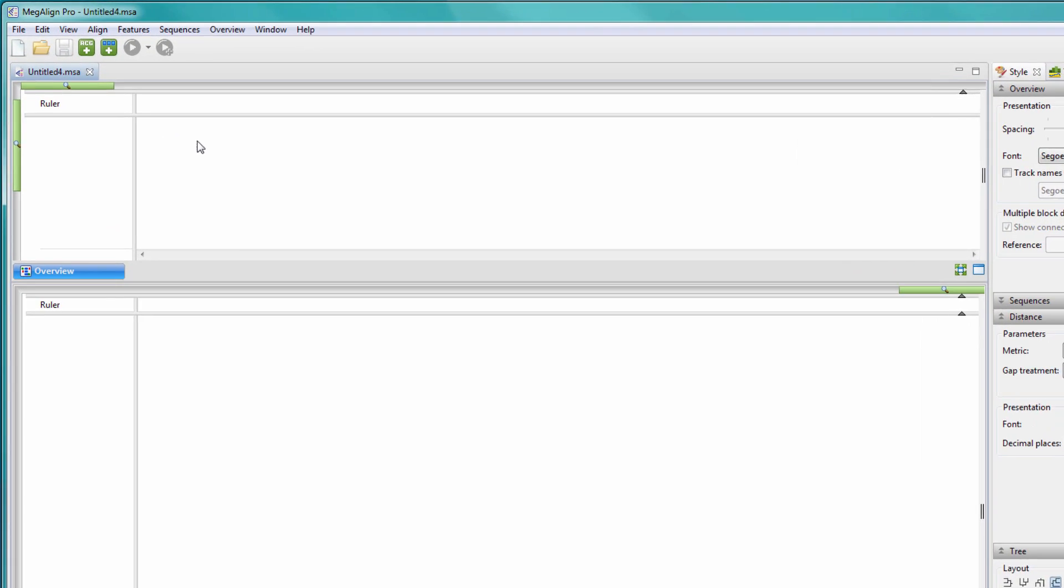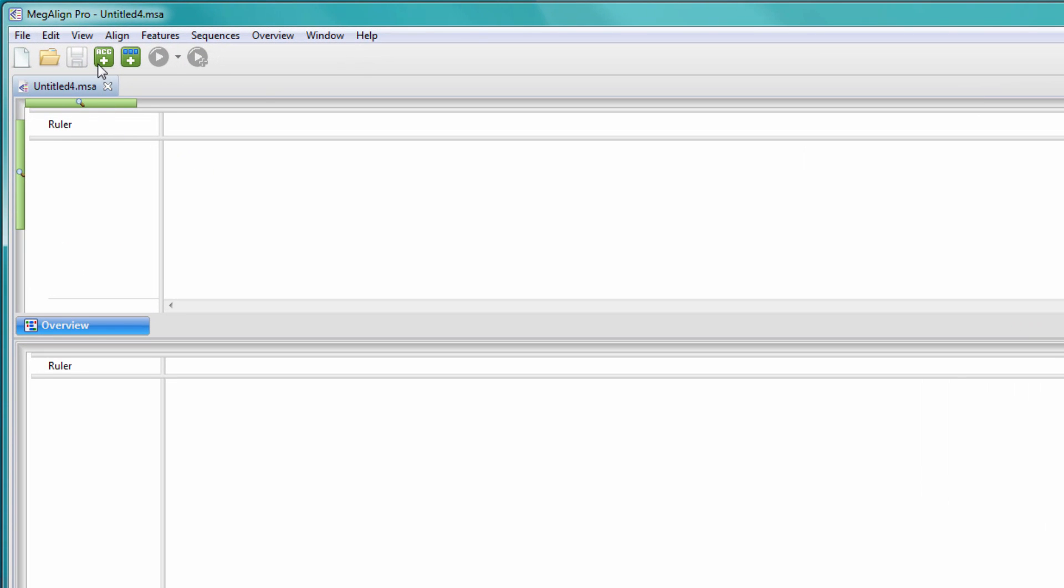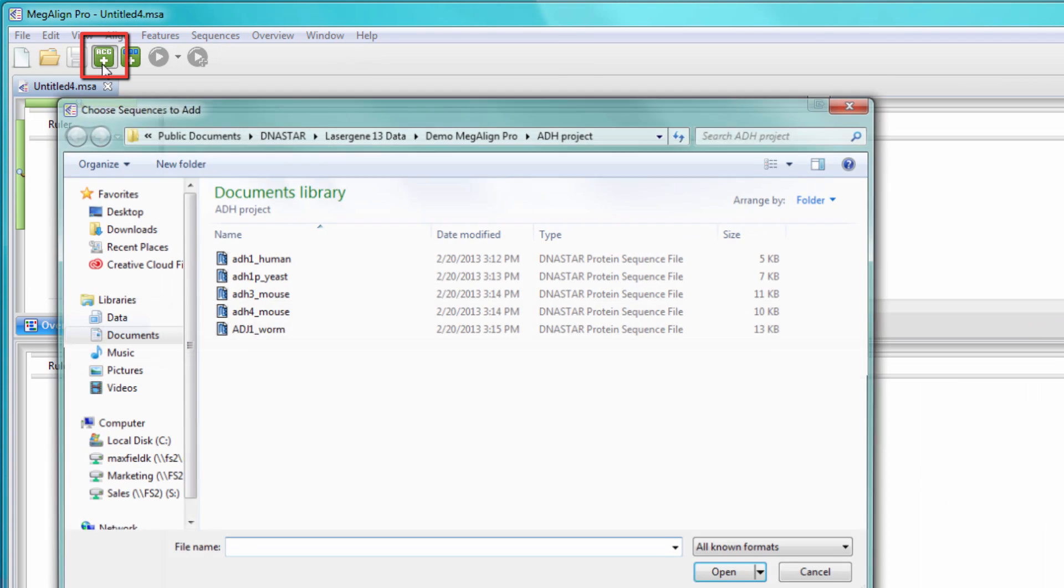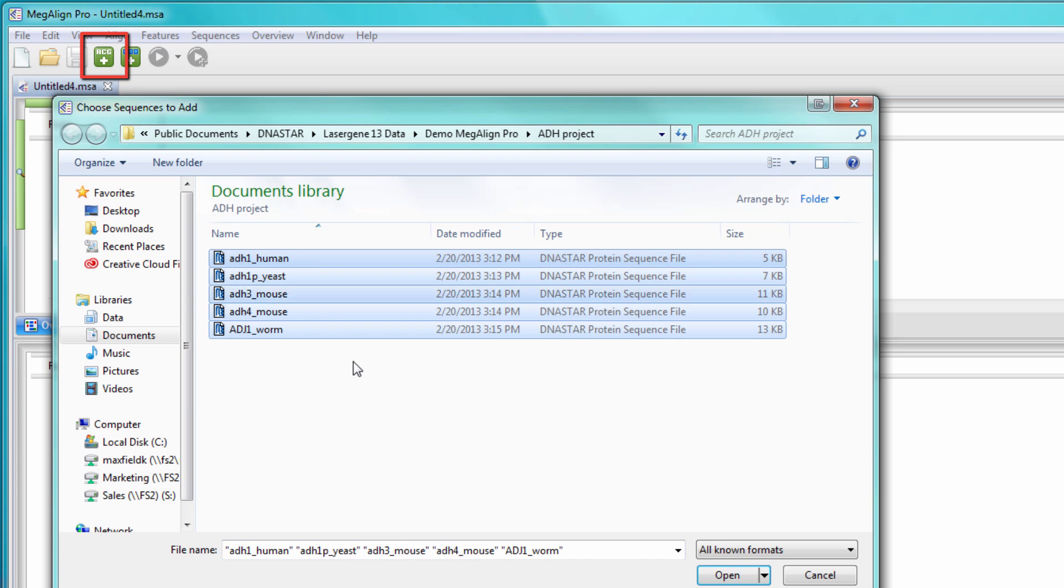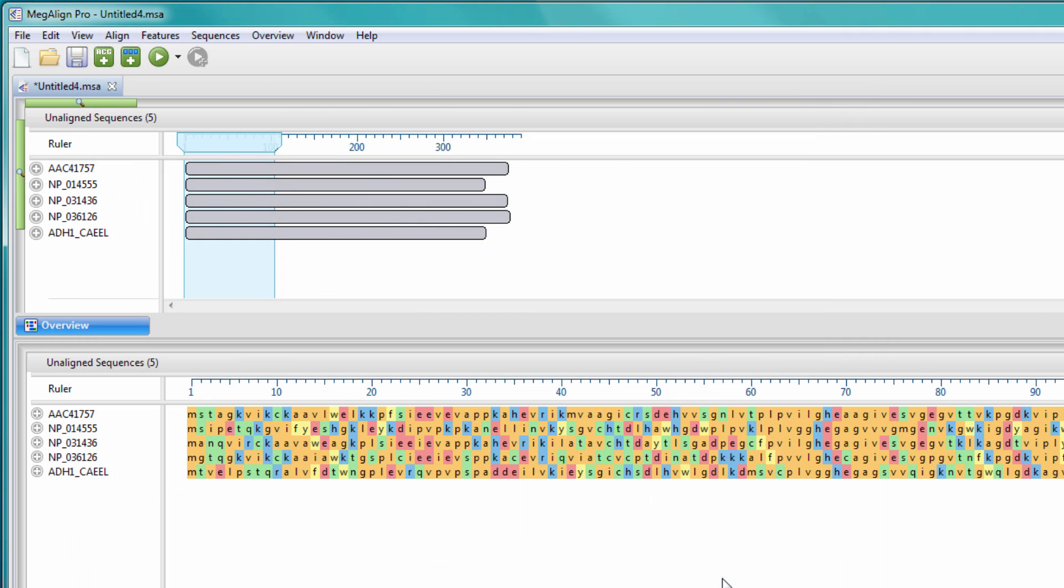To create a phylogenetic tree in Megaline Pro, add your DNA, RNA, or protein sequences to a new document using the Add Sequences button.